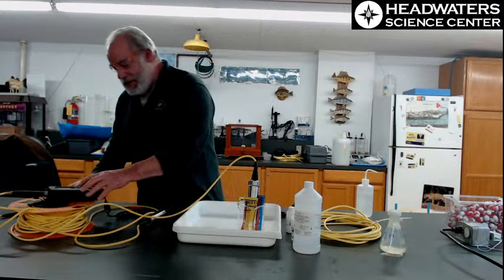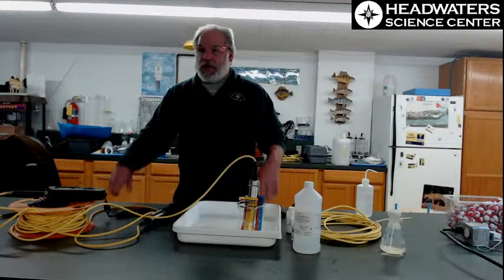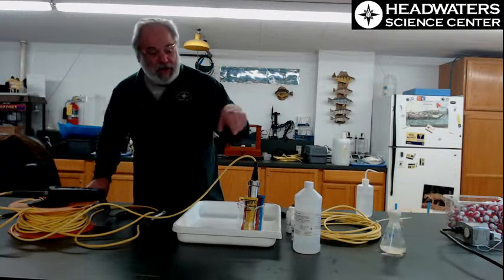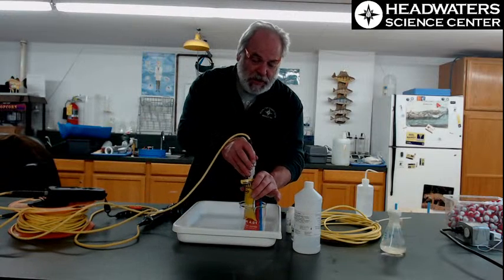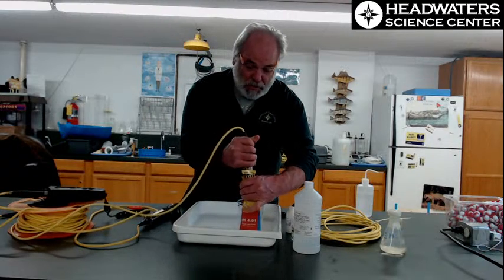7.13, but the meter's still trajectorying itself towards calibration. We'll calibrate it for that, get it going. So it was okay down in the acidic range, and now the mid-range, we've got it calibrated to 7.02, which is the right calibration for this temperature, which is, by the way, 65.2 degrees Fahrenheit is where we're calibrating this stuff at.